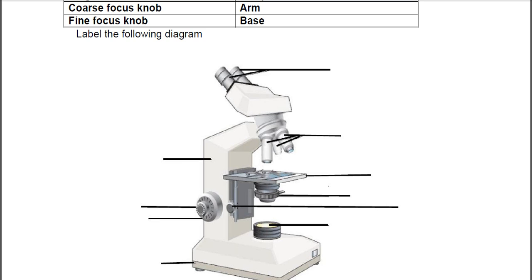This here is the stage adjustment knob, which will allow you to fine tune the stage location. This large knob over here is actually two knobs. The large knob is the coarse focus knob. The smaller one in the middle is the fine focus knob. If you put a microscope slide on the stage, you would use the coarse focus knob to get it pretty close to in focus, and then you would use the fine focus knob in order to get it perfect for you. We all have different eyesight, so what's in focus for me is probably not going to be in focus for you.